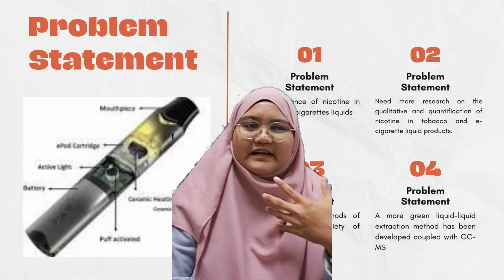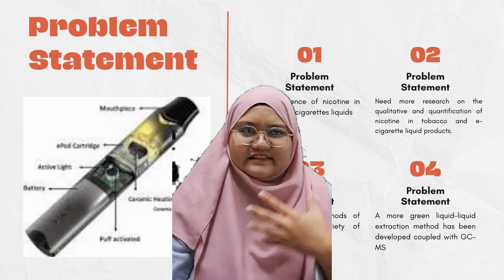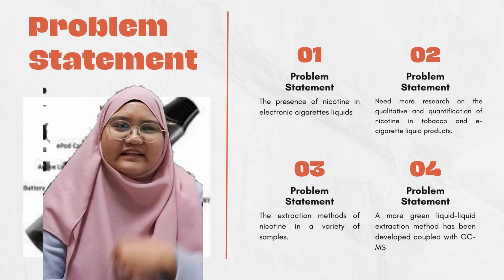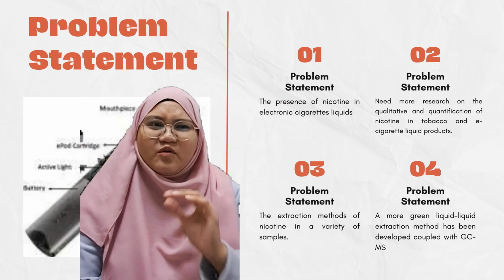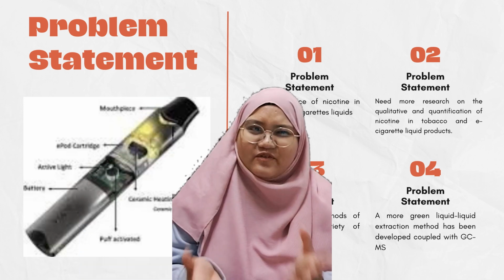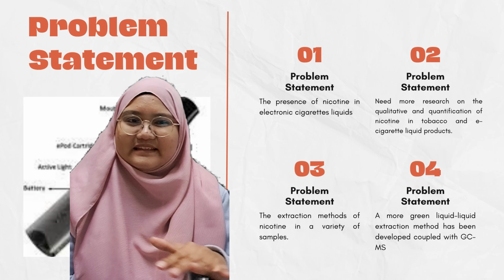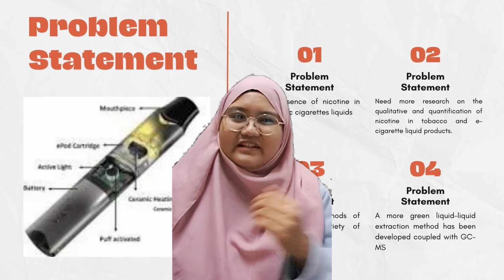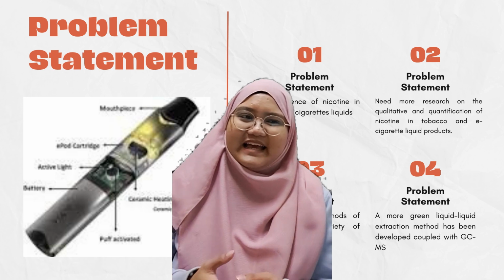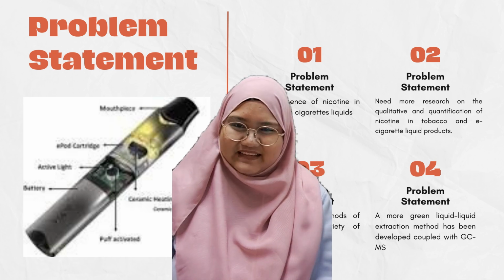So the problem statement for my project is the presence of nicotine in electronic cigarette liquids. That's why we want to check the concentration. The second problem statement is that more research is needed on qualitative and quantitative analysis of nicotine in tobacco and liquid products. The third problem statement is the variety of extraction methods for nicotine in a sample. And the fourth and last problem statement is that a greener liquid extraction method has been developed coupled with GCMS, which is DLME extraction.